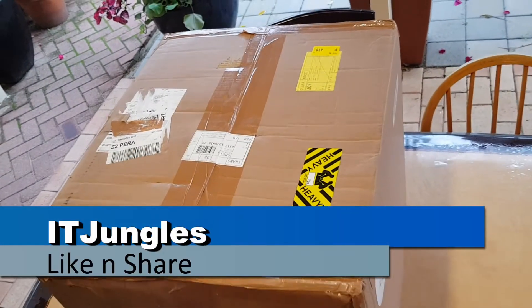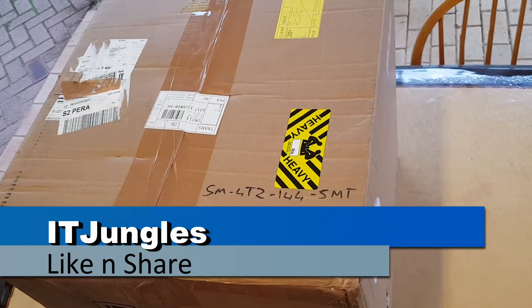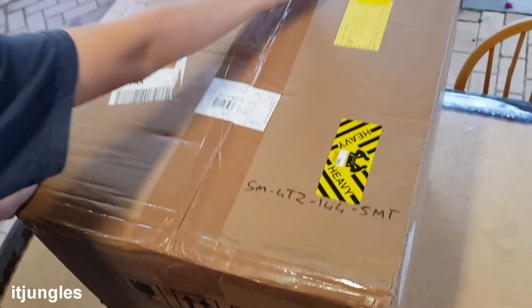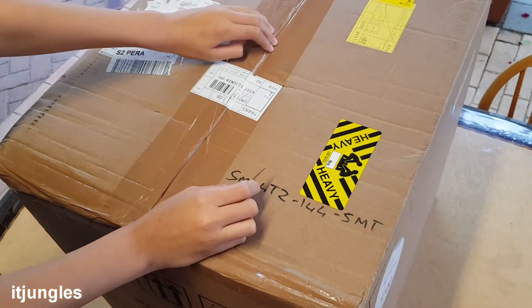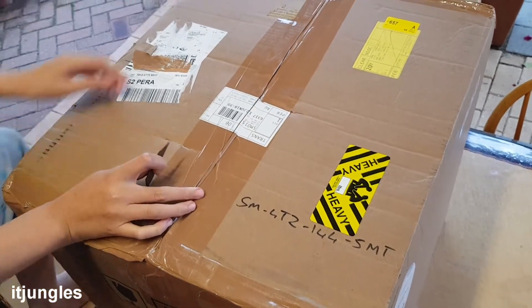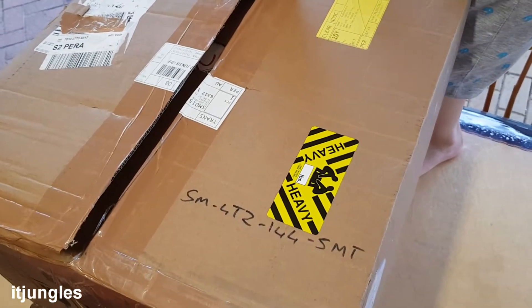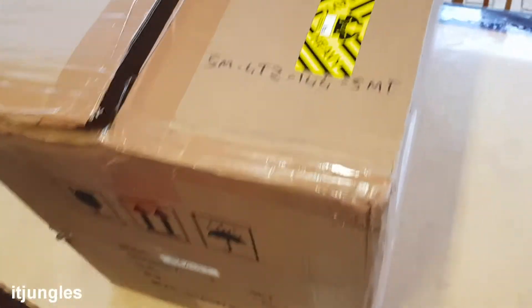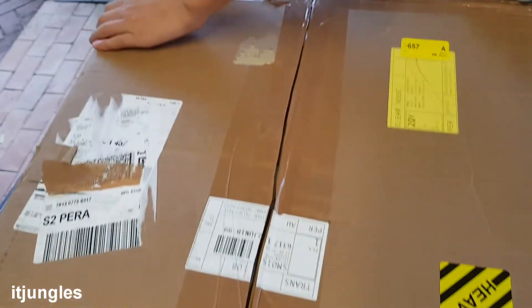In this video we're going to do an unboxing video of the Amscope, model SM4TZ-144-5MT. This is a microscope, so we'll look at the boxes it comes in when shipped from the company. I'm just going to use a blade and cut it open. It's quite heavy at 35 kilograms, so you probably need someone to help with lifting. It even has a heavy lifting sticker right here.